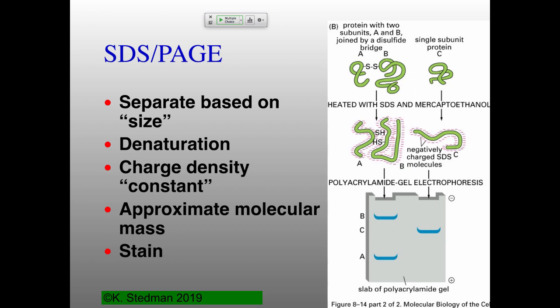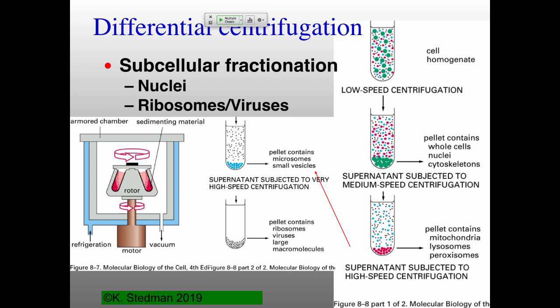But be that as it may, the next thing that you have to do is somehow visualize these proteins, because usually proteins don't have color. Sometimes they will, but usually in the denaturation process, you're going to lose whatever kind of chromophore they have bound to them. So you also have to stain your proteins. These are often stains that were originally used for clothes. Coomassie blue is a standard stain for proteins. It was also originally used for staining clothes, but it allows you to visualize where these proteins are relative to each other. And we'll see an example of SDS-PAGE a little bit later on. So this separates your proteins by their relative molecular masses.